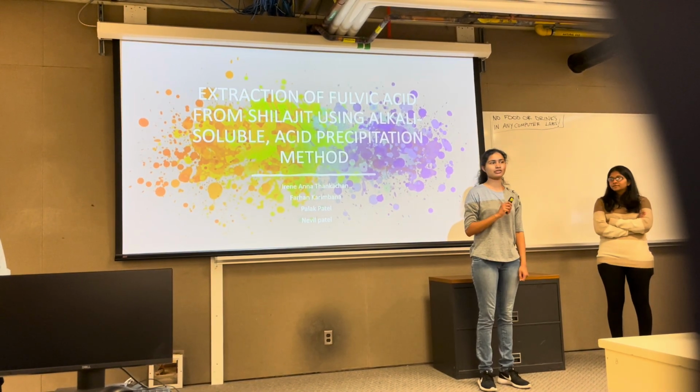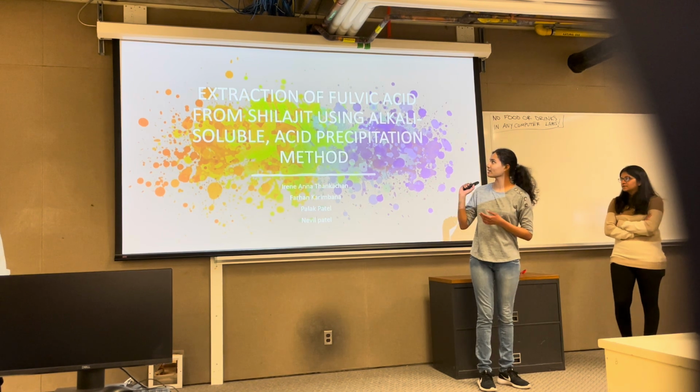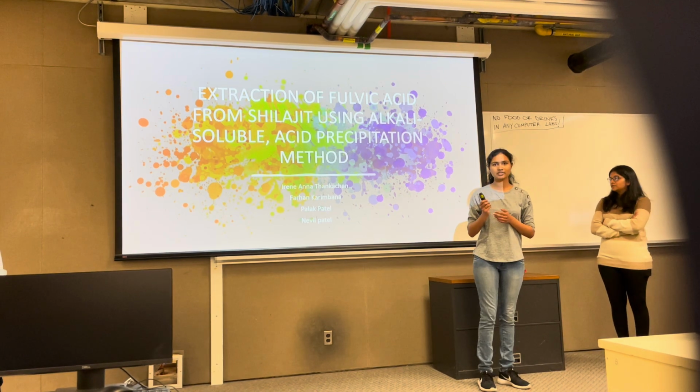And today we're going to talk about the project we have done so far for the 3 months, and it's the extraction of fulvic acid from Shilajit using the alkali soluble acid precipitation method.